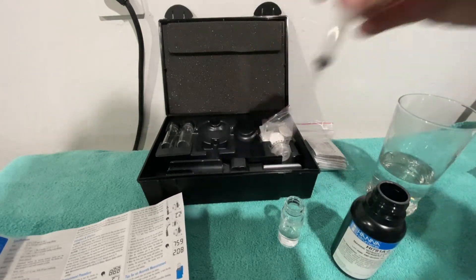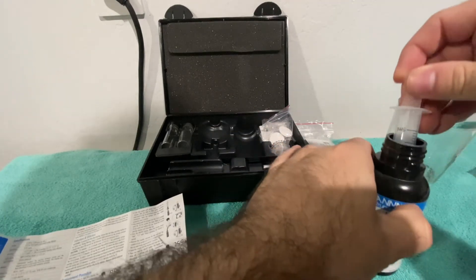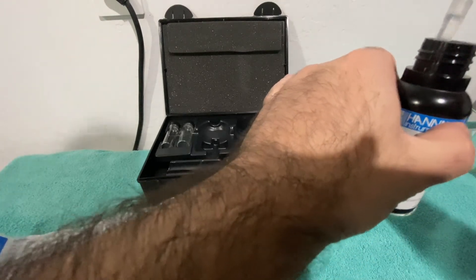Get four milliliters of reagent A. It's got this little plunger at the end to help you get the liquid out. Keep in mind there's going to be a gap at the top, but basically if you fill it pretty much to the top that's roughly four milliliters.